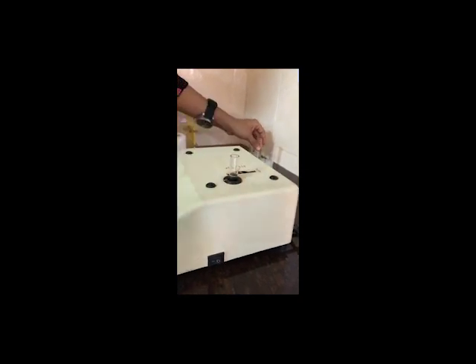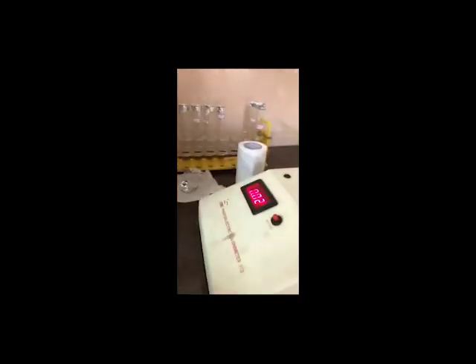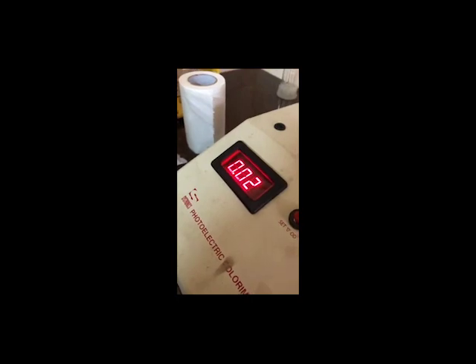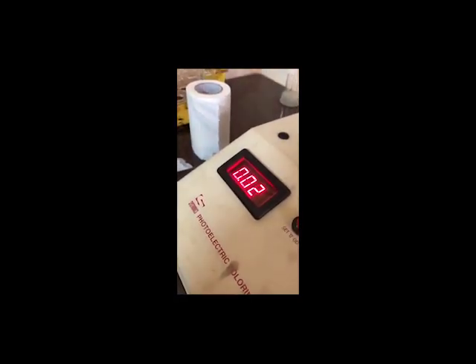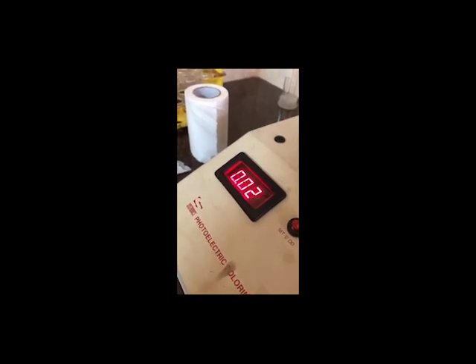Next, I am going to measure the first standard. Placed here, and measure the optical density. Like that, all the standard solutions as well as the test should be measured.